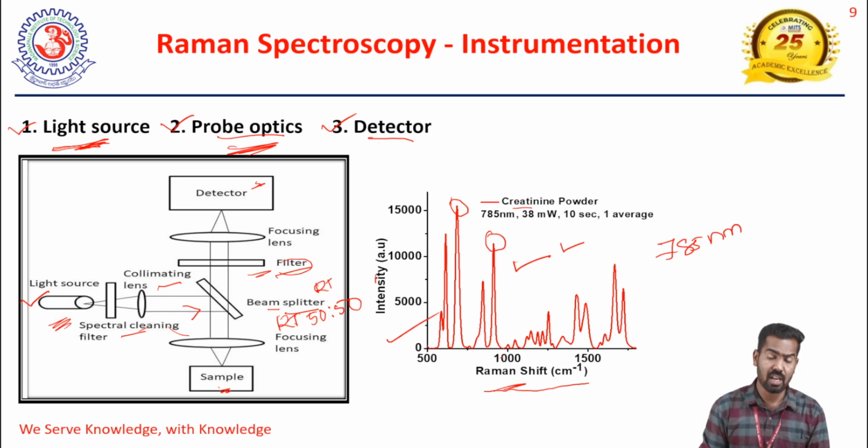What I mean by Raman shift is very easy to understand. It depends on which light source or which laser we are using: 532, 633, 785 are available. So it is the shift from that light source, the lasers. Actually, this is a shift in the wavelength, where you can see the peak with respect to your light source wavelength. There is some difference you are observing in the Raman spectra. That is why it is called Raman shift.